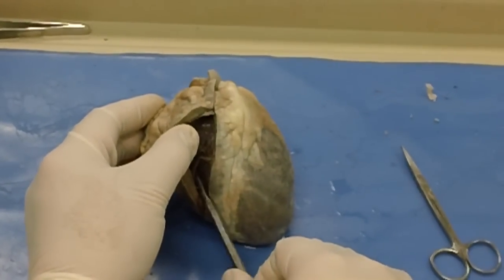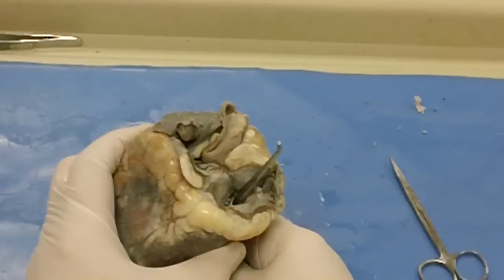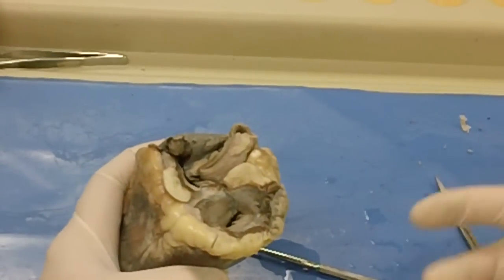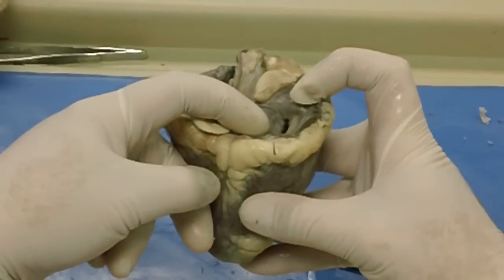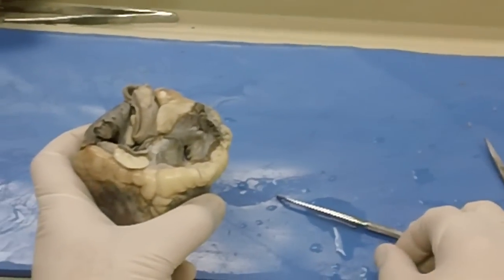The vena cava? Right, the vena cava. Right atrium? Right atrium. Okay? Well, unfortunately, they've cut it all off. They've cut off the vessels. Okay, so this is the right atrium, which means that there should have been a vessel coming in right here where my finger is, which would be the vena cava, and one coming in this way. Cranial and caudal vena cavas. But they've removed the top part of the right atrium there.